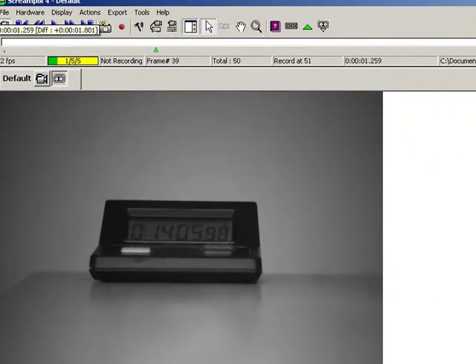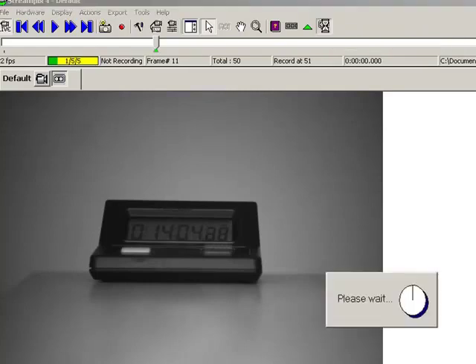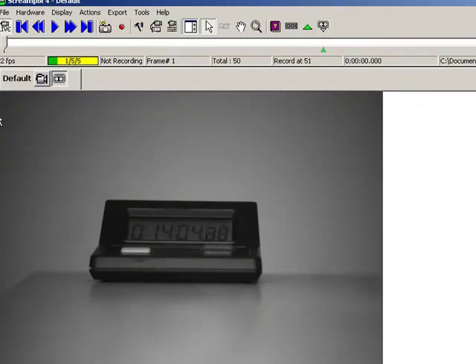But what's interesting, and this is the reason I added a second button, is it doesn't necessarily follow that they're going to sequence correctly from your frames before and your frames after, because we're playing with memory buffers. So this button here says sort the order into chronological order. So it's going to put it all time correct. So now this is my frames before, everything before that happened, and then that's everything after the trigger.